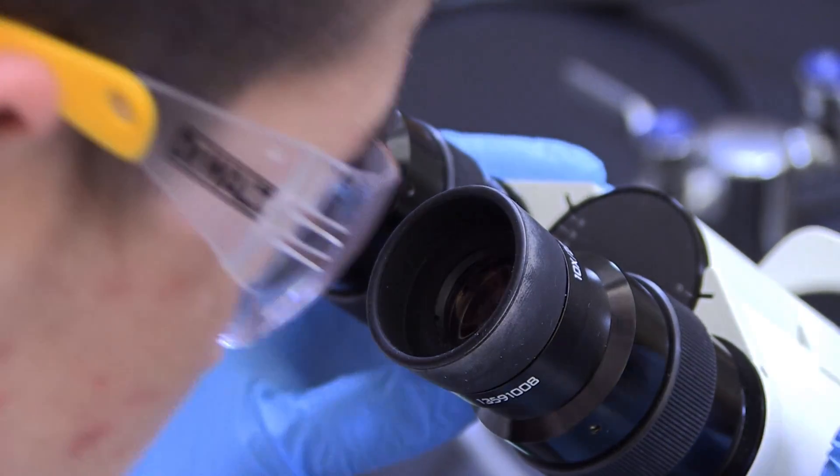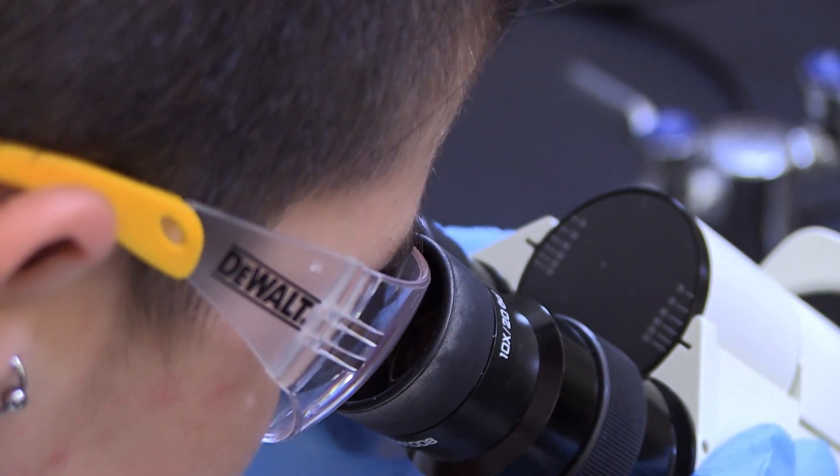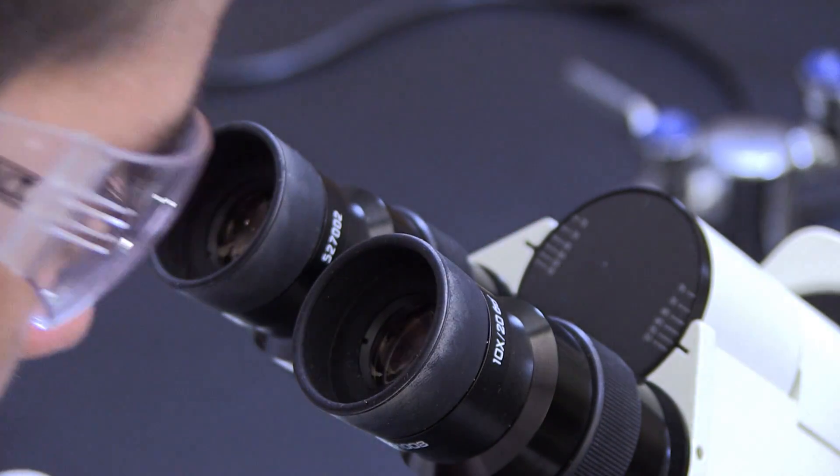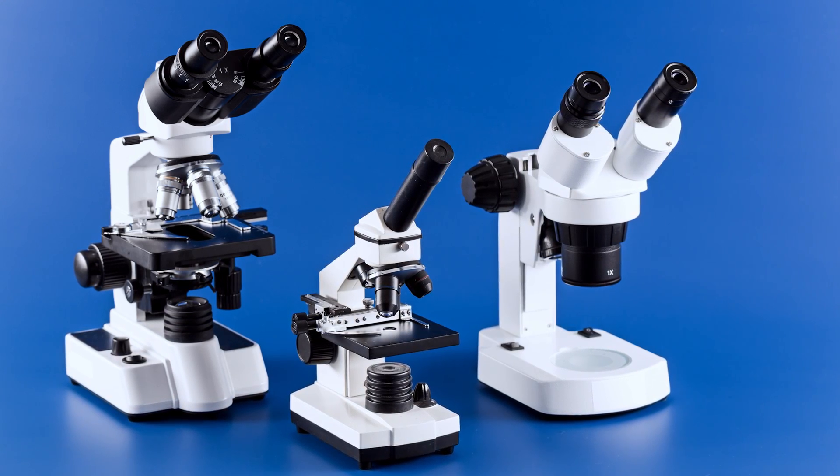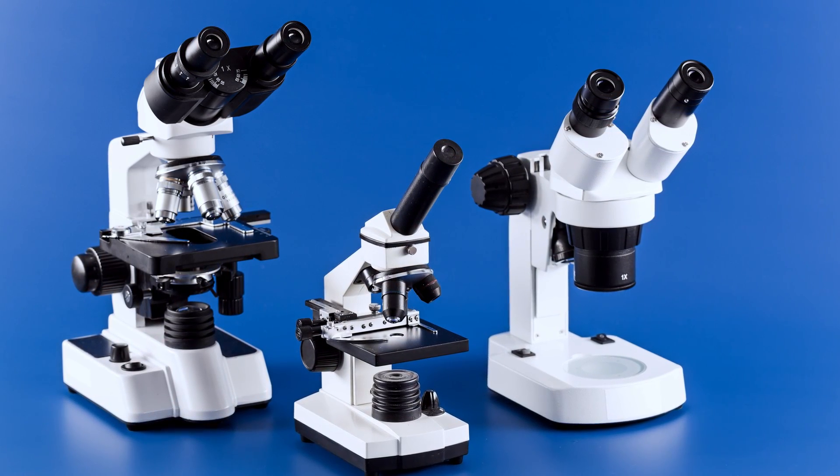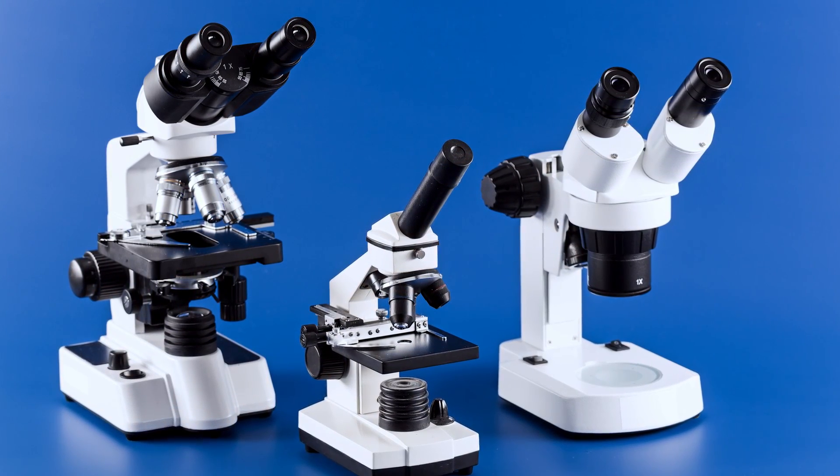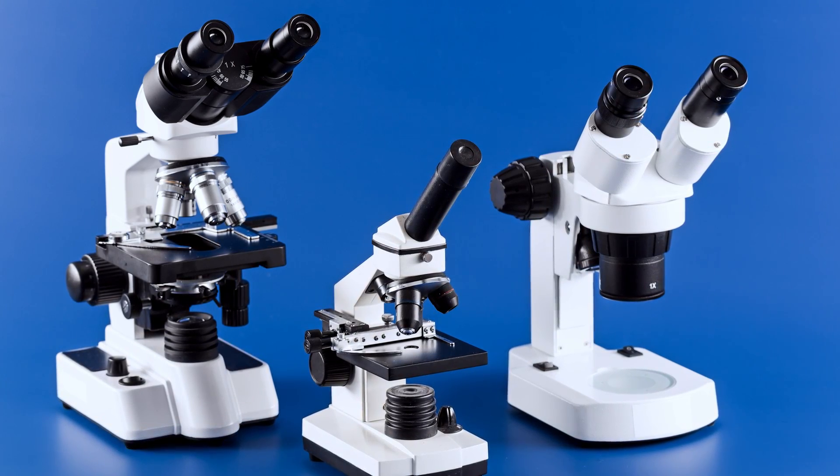Ocular lenses, the third lens system of the light microscope, are those closest to your eyes. In most instances, these lenses have a magnification of 10x. Binocular microscopes have two sets of these, while monocular microscopes have only a single ocular.